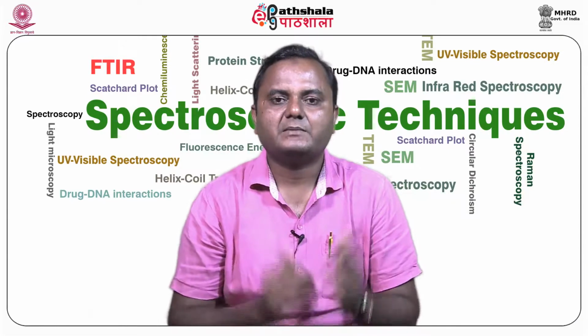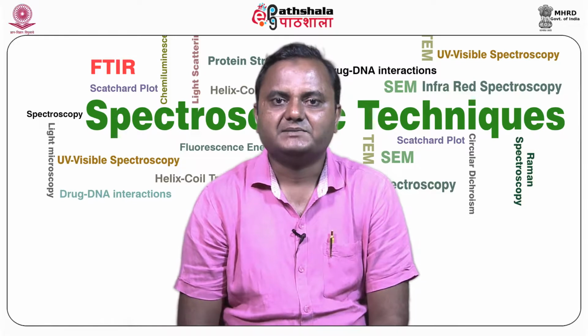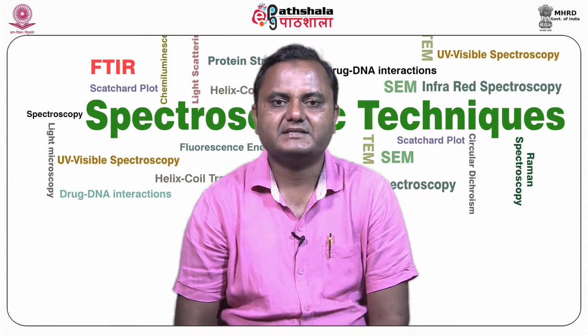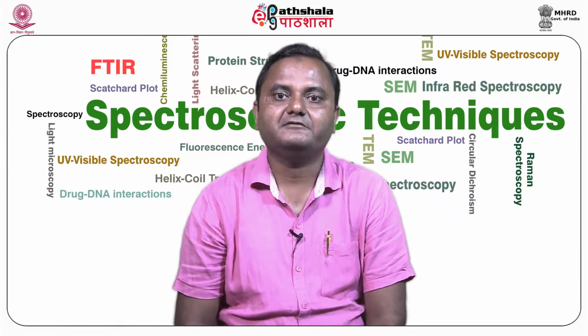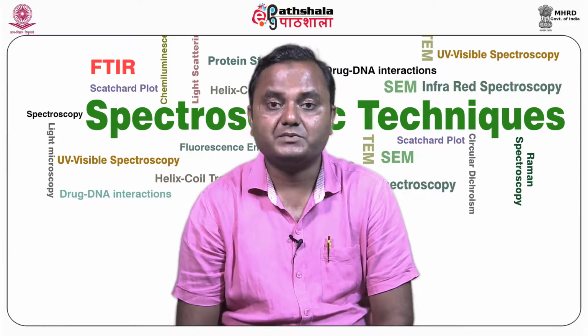Now we will discuss some limitations of the light scattering techniques, especially SLS. The volume of the sample has to be higher than with some other methods. It depends on the specific setup, but typically 1 ml volume is required. The concentration of the sample has to be high enough.